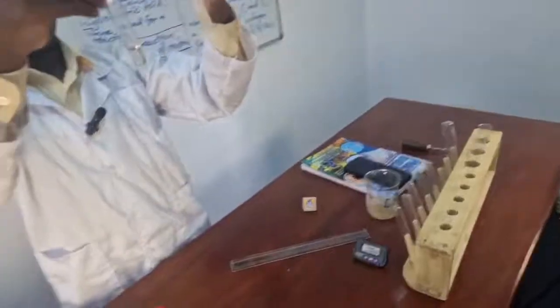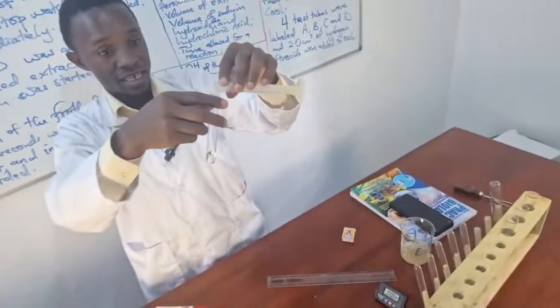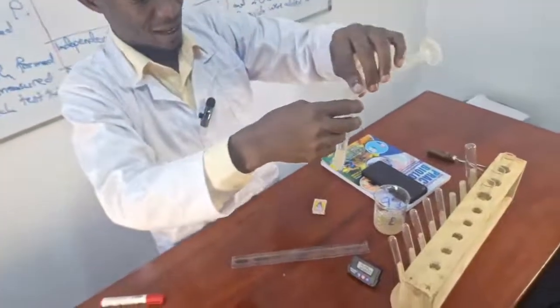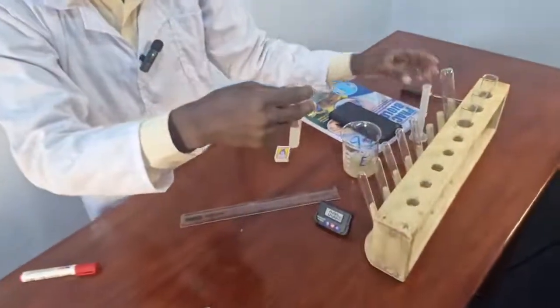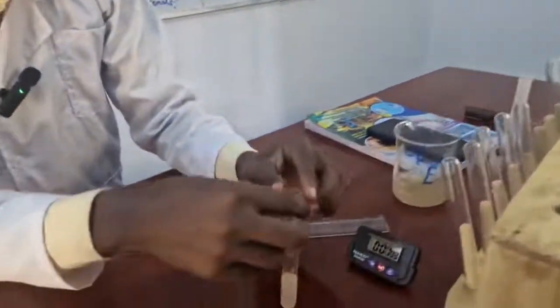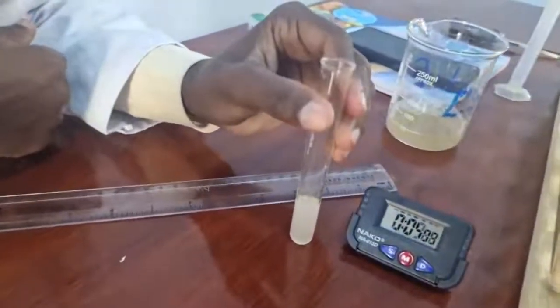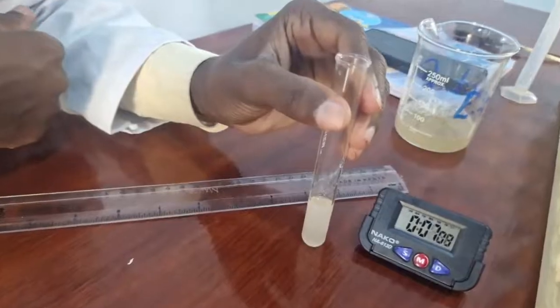This is my test tube C. I'll add the extract. I've added the extract. I've started my stopwatch. I'll determine the length of the froth formed after that time.